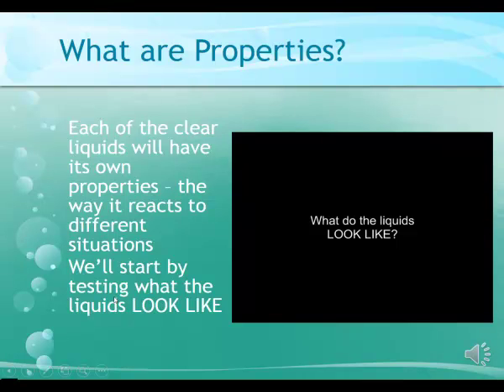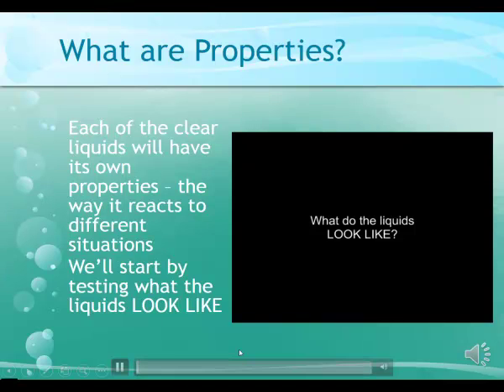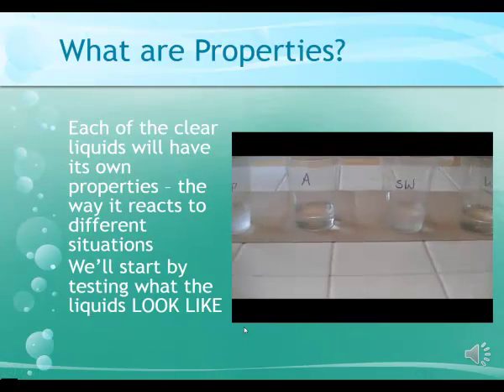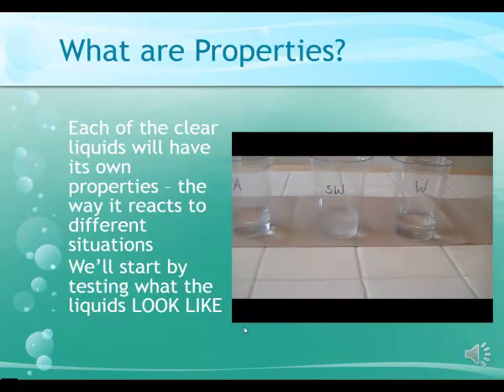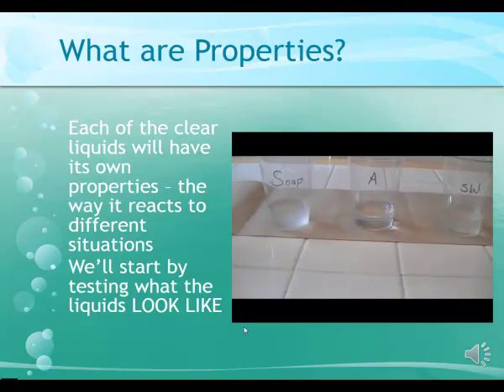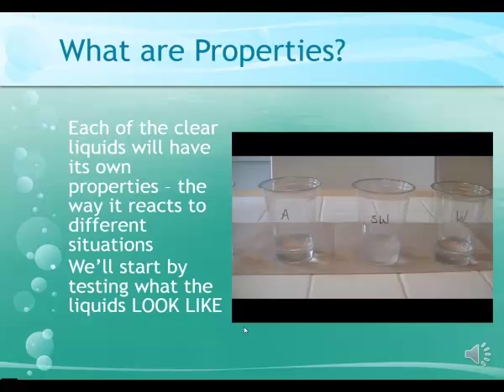Each of these clear liquids will have properties of its own, the way that they would react in certain situations. So we're going to start by testing first what these liquids look like. I've put our cups on a brown paper towel just so we can see a little contrast. Do you see anything that is noteworthy?